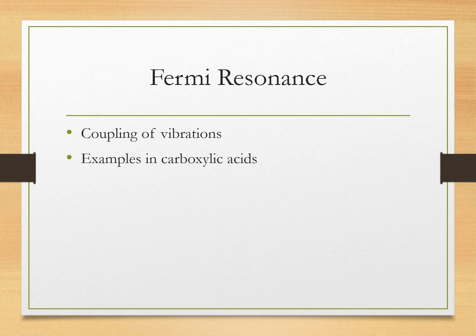Now, what is Fermi resonance? In some systems, especially carboxylic acids, a phenomenon called Fermi resonance occurs. Here the OH stretching vibration couples with overtone or combination bands. This interaction produces a split or unusually broad peak. Recognizing Fermi resonance is important because it helps to differentiate strongly hydrogen bonded systems, especially dimers.